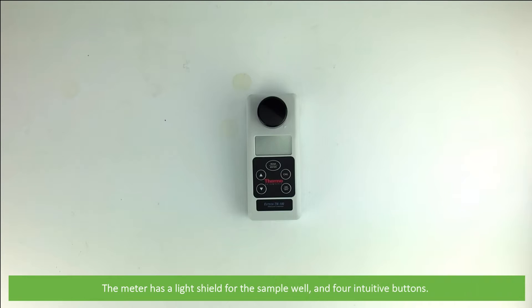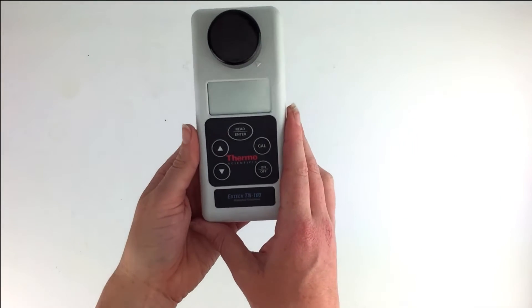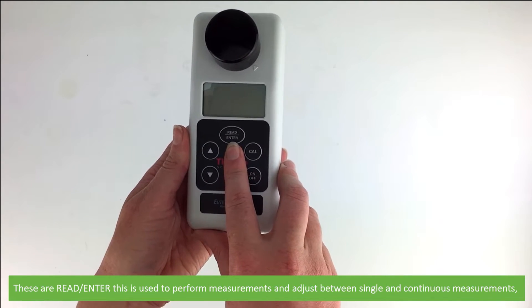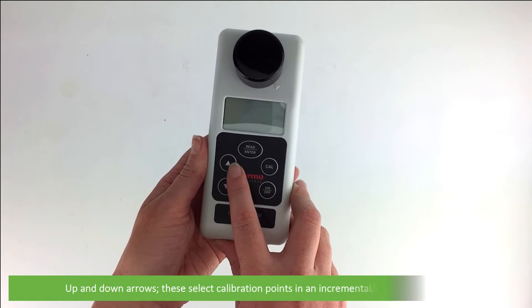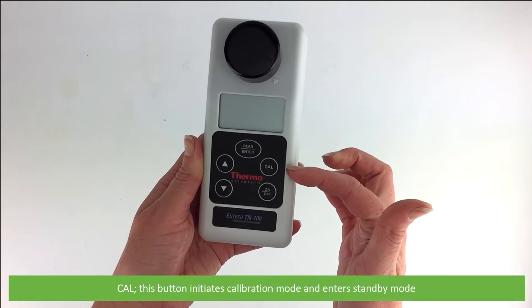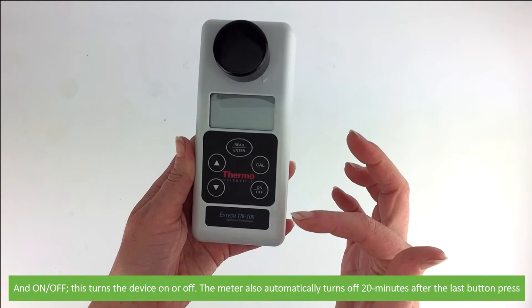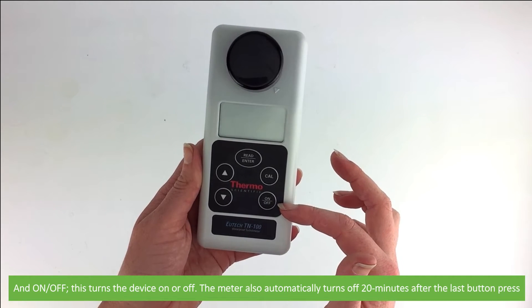The meter comes with a light shield for the sample well and four intuitive buttons. Read/Enter — this is used to perform measurements and adjust between single and continuous measurements. Up and down arrows — these select the calibration points in an incremental or decremental manner. Cal — this button initiates calibration mode and enters standby mode. And lastly, On/Off — this turns the device on or off. The meter also automatically turns off after 20 minutes after the last button press.